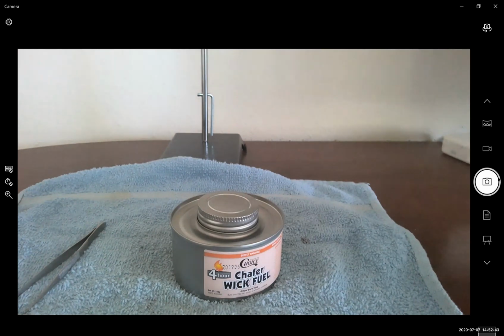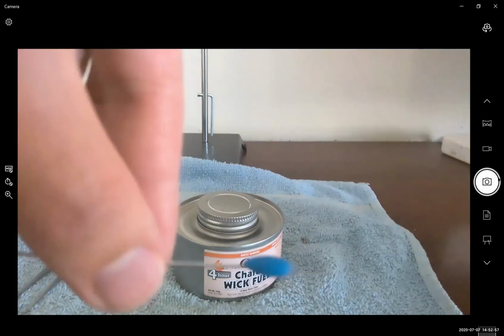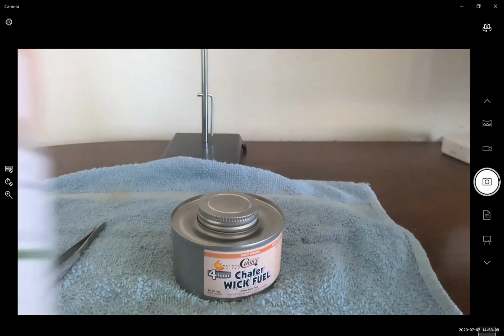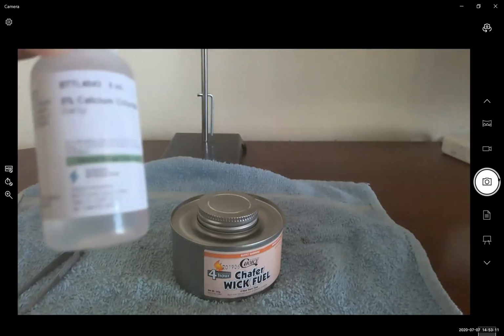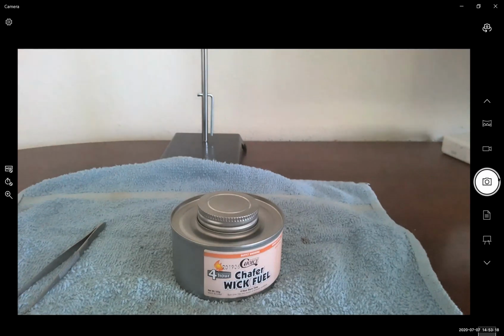Additionally, we have our pre-prepared inoculating loops. Here we go. So here's our pre-prepared inoculating loop. Notice how at the other end we have some insulating clay just to minimize heat transfer. We're going to dip our inoculating loop into each of these packaged solutions, and we're going to observe the color of the flame after heating our sample. Make sure to not cross-contaminate the loops. So we have a total of 4 loops, one for each solution.